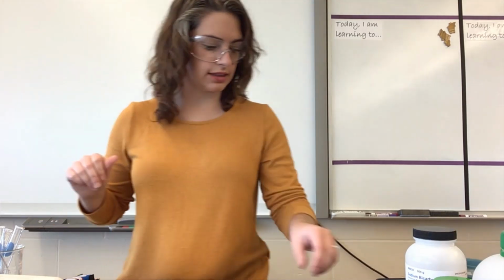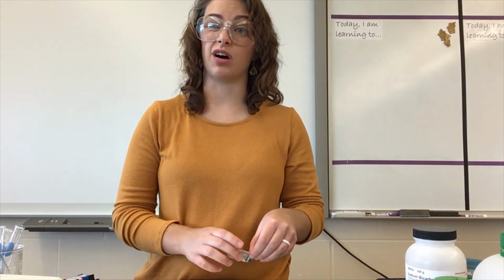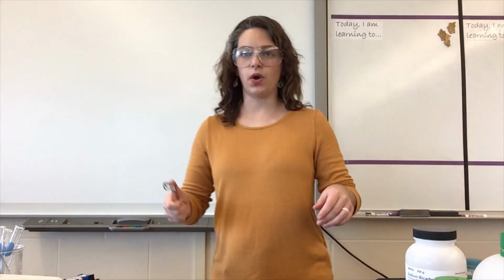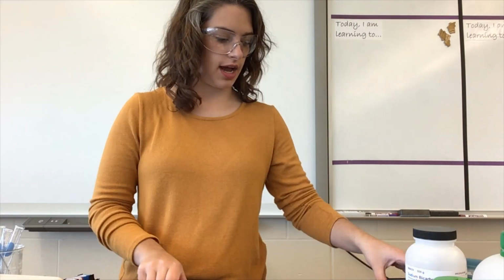Okay, and then the last piece is for the melting point. And before I do this one, I'm going to go get tongs to be able to grab this off. Okay, and we're back. So I'm going to put my weigh boat on my hot plate.